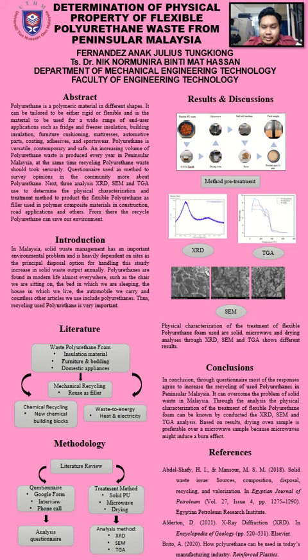So based on the result, I repeat it again, the drying oven sample is the best sample compared to microwave and solid, because the microwave might induce a burn effect. So that's all from me. Thank you.